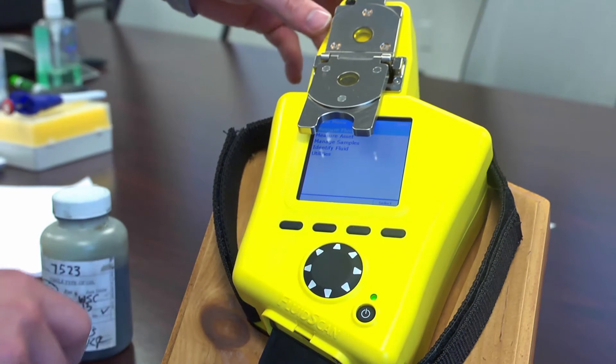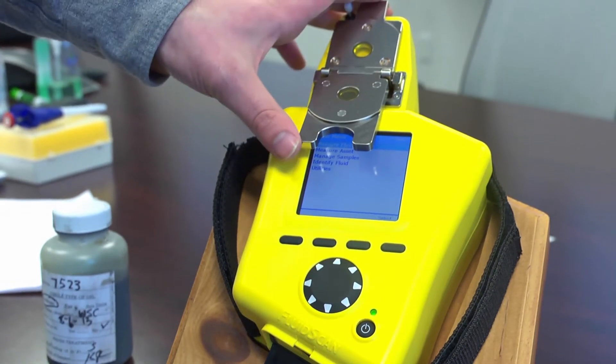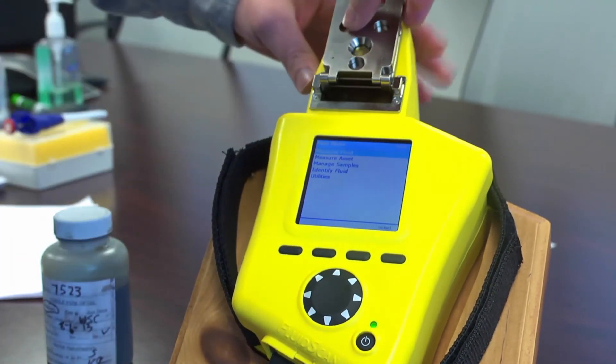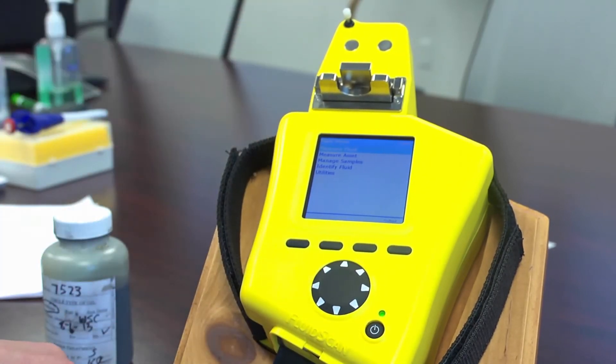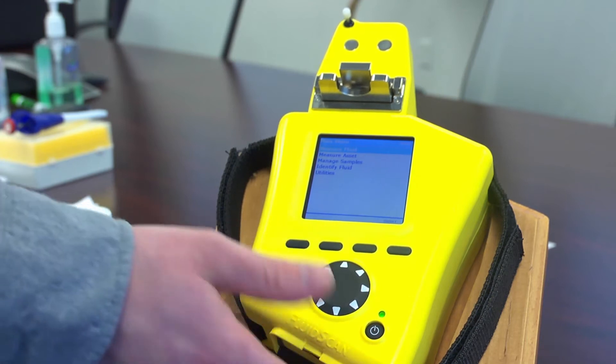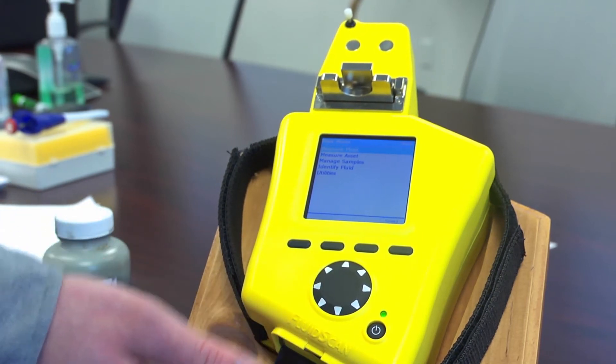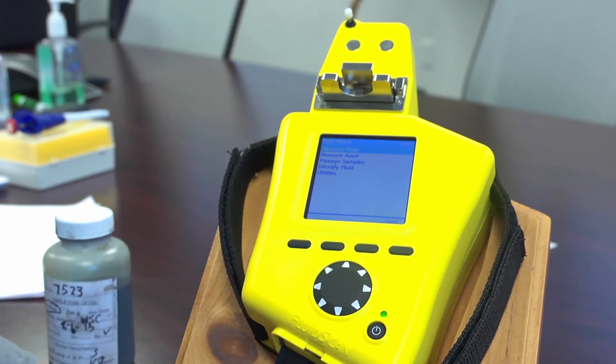You place a single drop onto the flow cell that when IR goes through it measures the absorbance and shows its resulting spectra. Due to algorithms we have through the unit, the spectra is then recorded and will be able to give specific results based on training purposes on the oil.